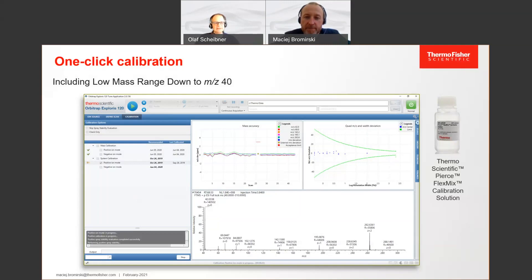Normally you only need to run the mass calibration, and the system calibration will tell you when it's needed — at maximum once a month, not more often. The mass calibration will also tell you when it's recommended to rerun. You can set a time period for which the mass calibration will be valid; once run, it will be good for at least 24 hours, but your system may even be stable longer. And keep in mind: when you use the easy-IC internal calibration while running the system, you're good for at least five days of constant operation without rerunning the mass calibration.